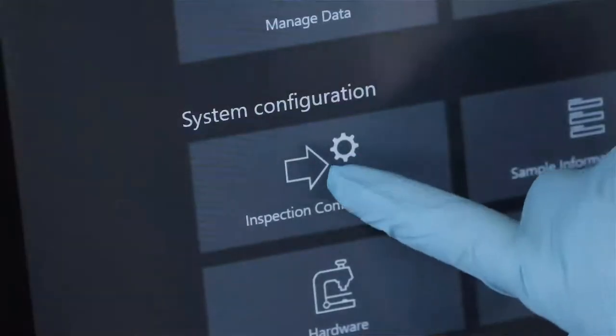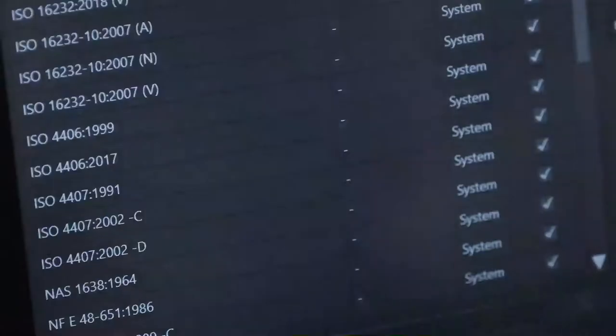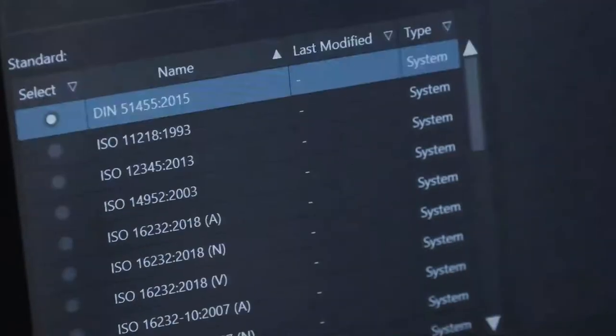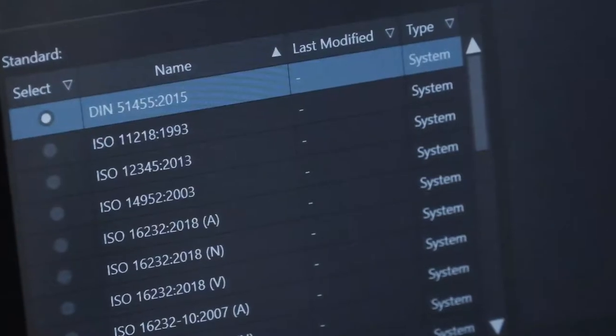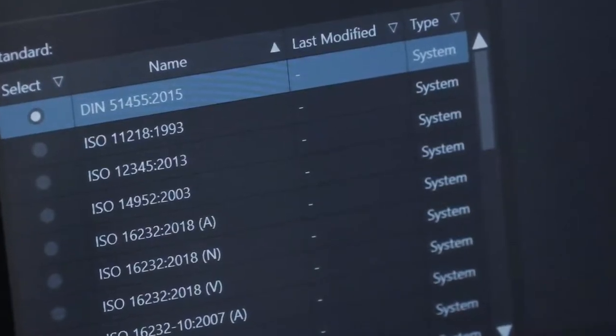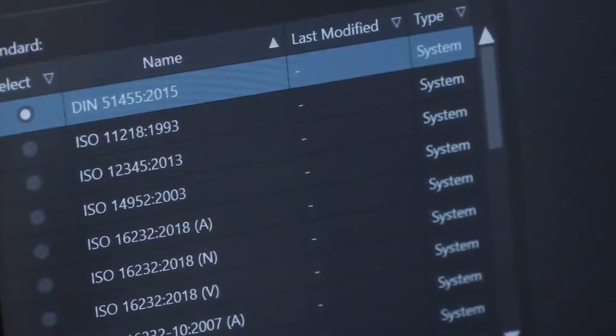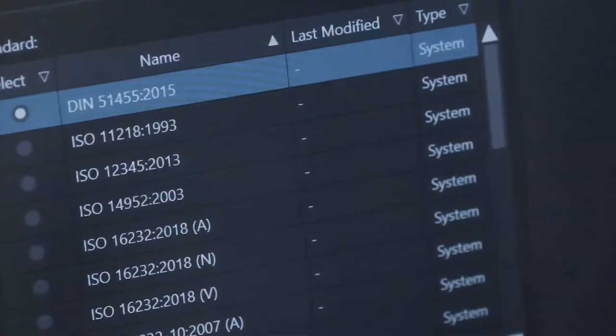Inspection configurations specify all the parameters for sample inspection, including rules for the characterization of particles. Just choose the right one and start your analysis with one touch.